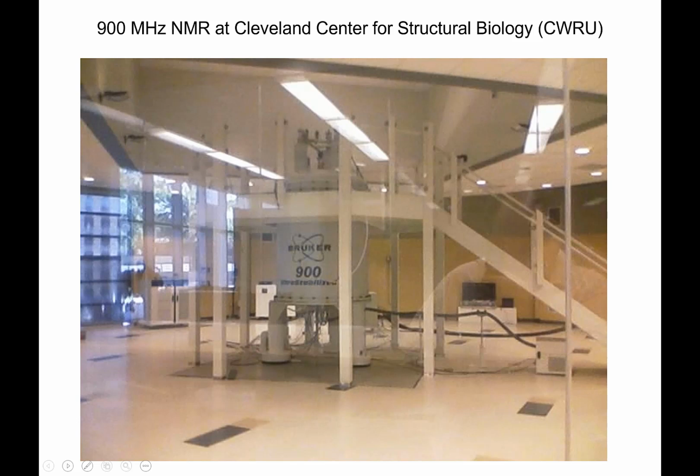Although with new magnets, what they do is they shield this so the magnetic field doesn't come out. But that's 900 megahertz. That's 3 times the power of ours.